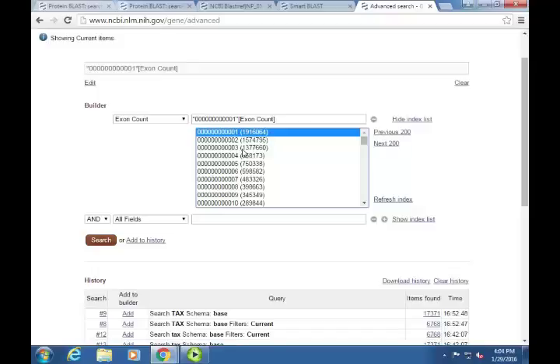It gives you a range. So if I have my own gene sequence, how do I do this? If you have your own gene sequence, you can just copy and paste your gene sequence right into BLAST and blast it and compare it to whatever shows up. So if you've run your sequencer and you get your results back, you should be able to import into BLAST directly. You can download a file into it, you can copy and paste.